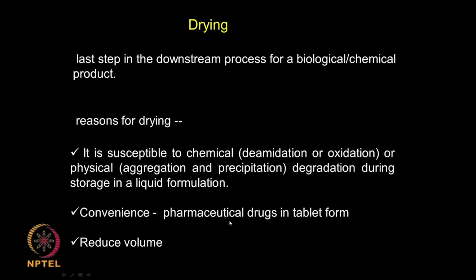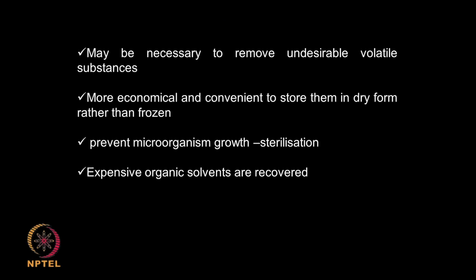It is convenient because pharmaceutical products, drugs, may be in tablet form. It reduces the volume, because for storage you are using less space if it is in a solid form rather than in the liquid form. It may be necessary to remove undesirable volatile substances. It is more economical because you may like to store them dry rather than in a frozen condition. You can prevent microorganism growth because there is no moisture, so the bacteria might not grow. If there are any expensive organic solvents, then by drying you may be removing or recovering those organic solvents.